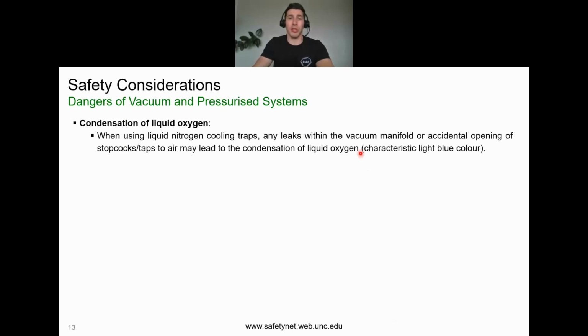And liquid oxygen alone isn't dangerous, but when it's combined with organic solvents that may be collected in your flask, or even grease, it has the risk of being very dangerous. So be aware of that at all times. It may mean that you consider using other cryogens to completely mitigate the risk of liquid oxygen.